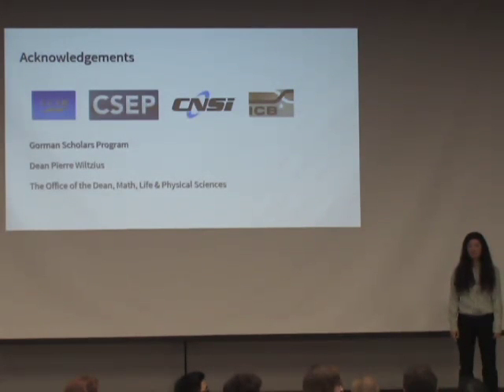How wide are the channels again? Oh, right. The channels that we're working with, the square channel is 100 microns by 100 microns, which is also the width of a human hair. And the chip itself is about 3 centimeters across.